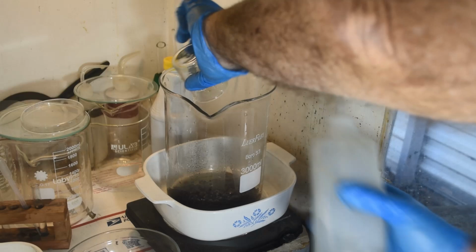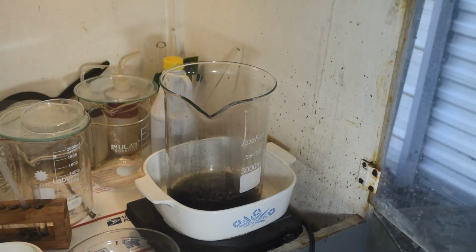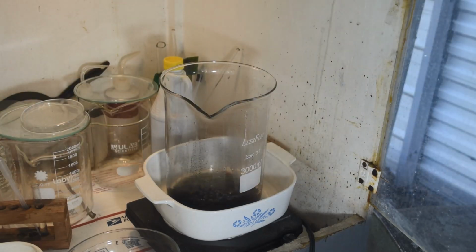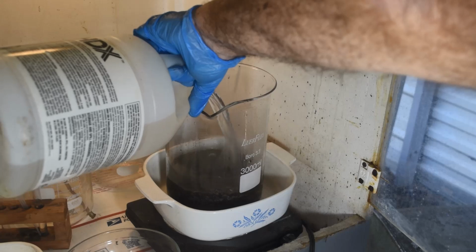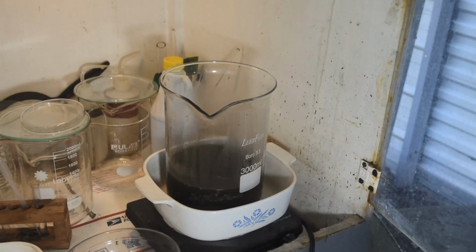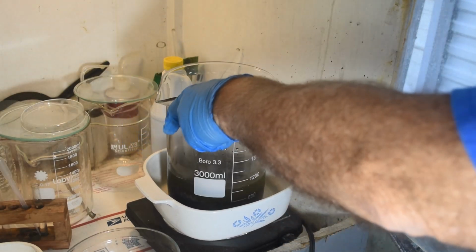There we go. Okay, so now we don't have to worry about screwing up our yield calculation. Get the fume hood going. And we're going to give this a treatment with hydrochloric acid. Put in, what is that? That's almost a liter of hydrochloric acid.